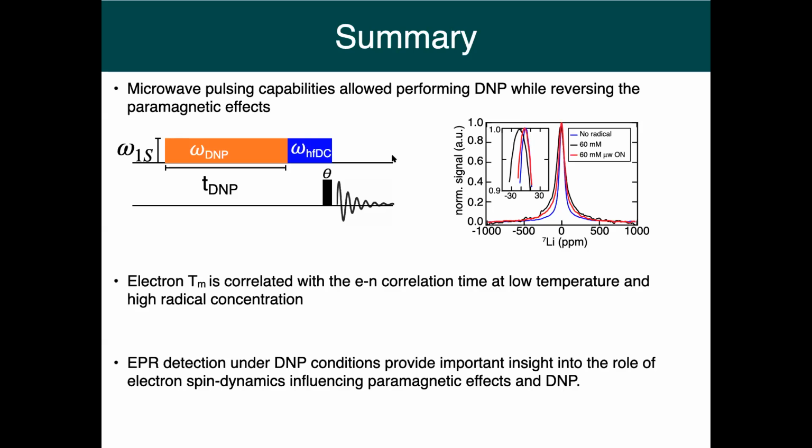Is there a prospect of combining these approaches? You made a very good case for the correlation time of the electronic motion being a function of the T2E or the T1E as the case may be, and that being the main source of the influence you're seeing. But how does it mesh with the other kind of finding?